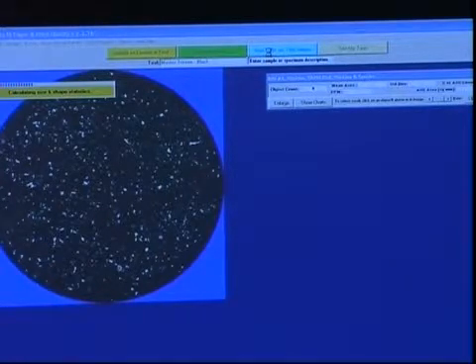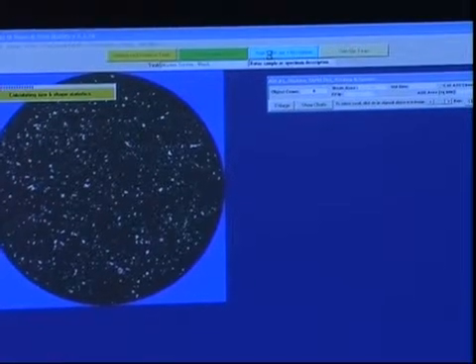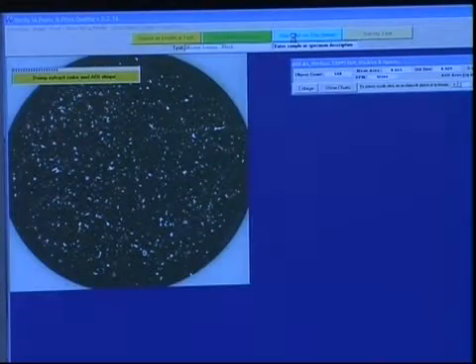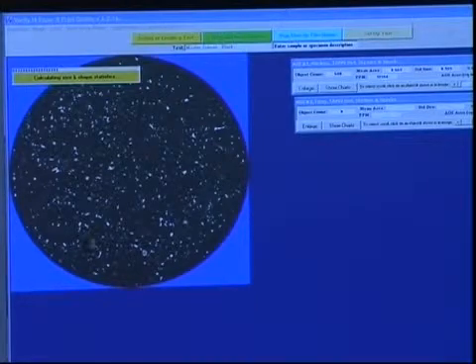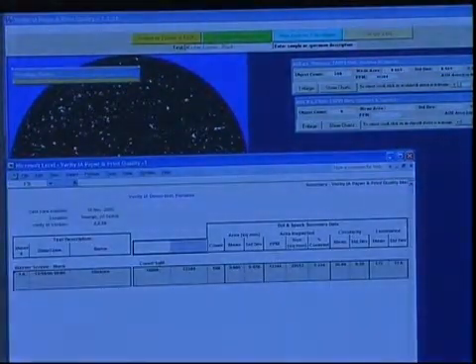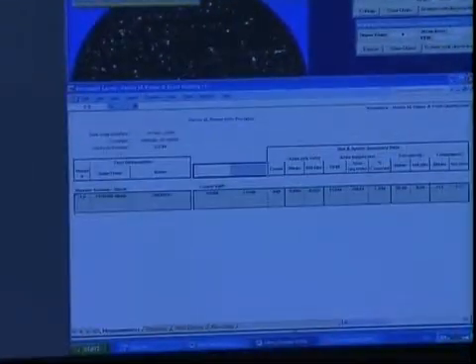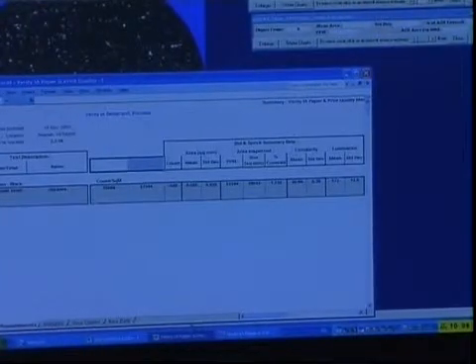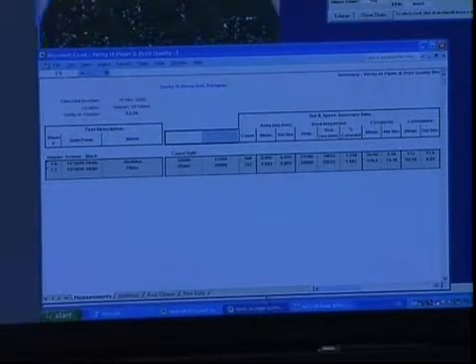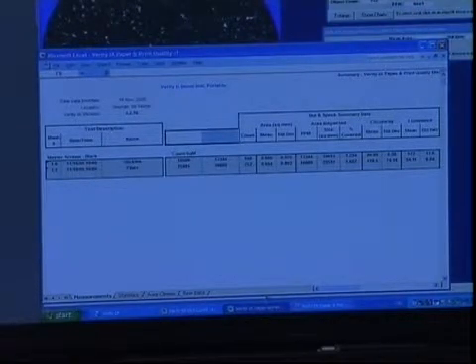And the results are dumped into an Excel spreadsheet on every test. In this particular case, when I'm measuring the image using the automatic controls, it will be transferred into Excel. And I think I can show you that. Yes, the stickies are reported, and it's busily calculating the fiber. And now it's going to do the hairy stickies.